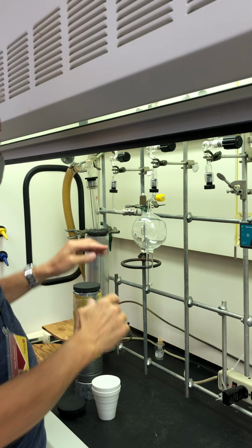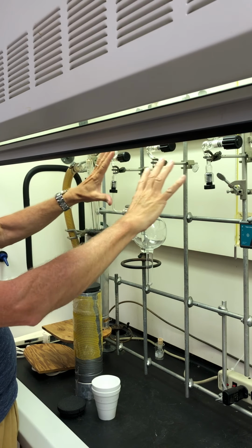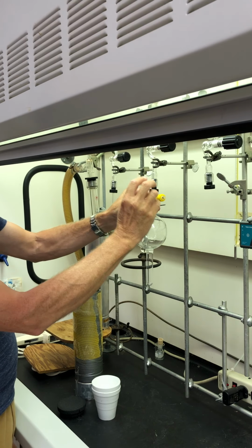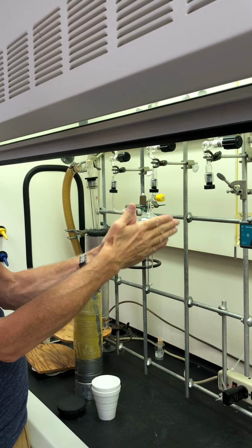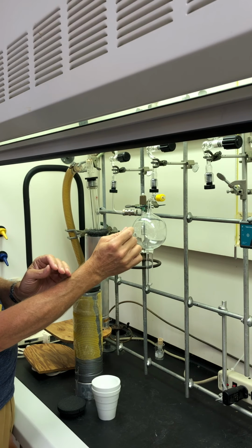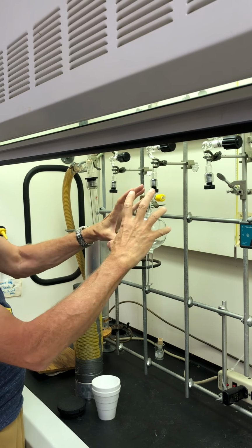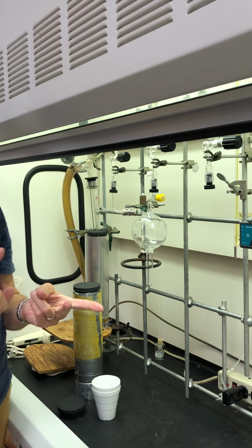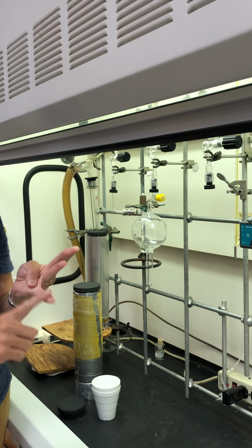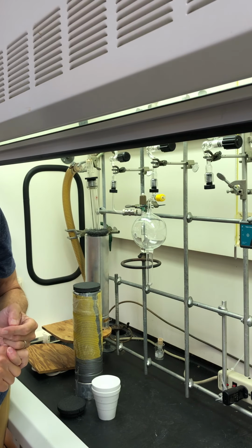The last part is we're going to let this liquid evaporate to fill the vacuum line and this bulb. We'll close this off with a measured pressure. The temperature is determined by this thermometer in the back of the hood. The volume is given on this little sheet of paper and in the lab guide. Once we fill it with a known pressure and close it off, we weigh it again. We'll have the mass, the volume, the pressure, and the temperature. And that's how you make measurements with this apparatus.